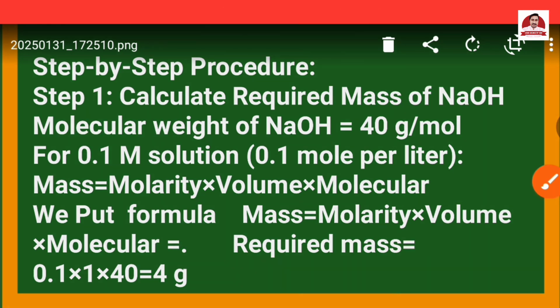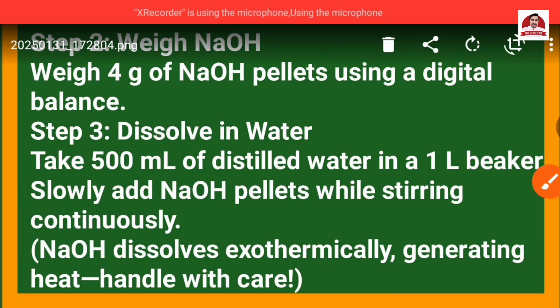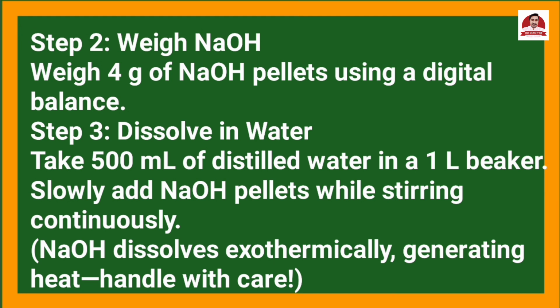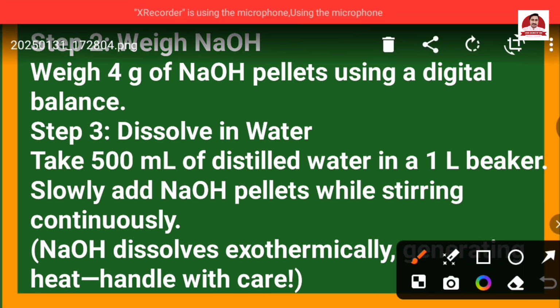Now in the second step, we take the sodium hydroxide from the bottle in the lab. Then we weigh 4 gram of sodium hydroxide using a digital balance.